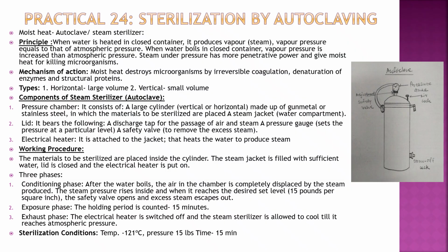After the water boils, the air in the chamber is completely displaced by the steam. So the steam pressure rises and then it reaches the desired level, that is 15 lbs pressure. Then the safety valve opens and excess steam is removed out. Exposure phase: the holding period is for 15 minutes. Exhaust phase: after the holding period is over, the electrical heater is switched off and the steam sterilizer is allowed to cool till it reaches the atmospheric pressure, and then the material inside is removed.